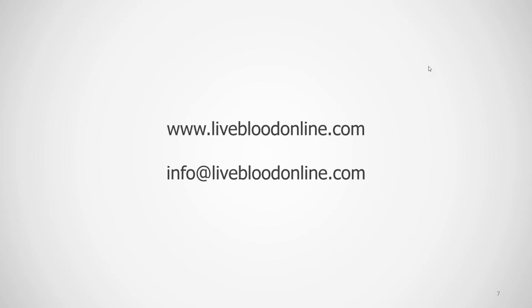Thank you. And the live blood analysis is also very useful for gauging the efficacy of any treatment, isn't it? With looking at the blood on subsequent visits. Yes, absolutely. It's extremely useful for that. A great benefit is this visual impact. People often get a bit of a fright when they see the condition of their blood, and they become motivated to do what needs to be done in terms of diet and lifestyle to improve that.